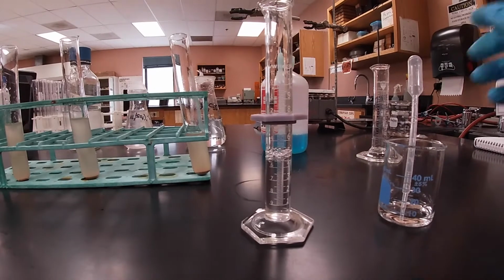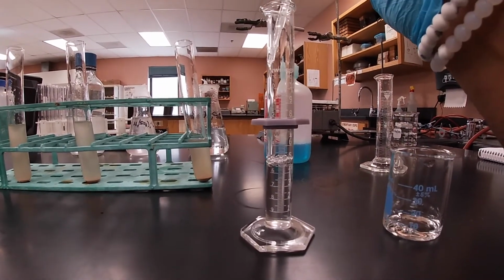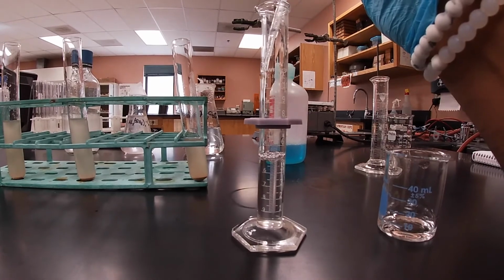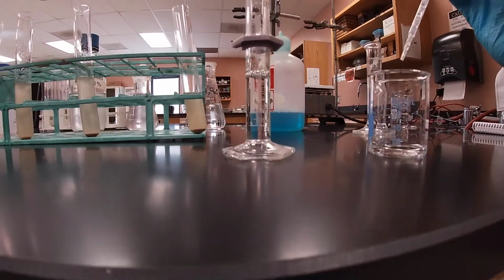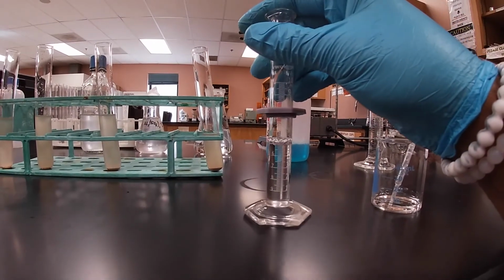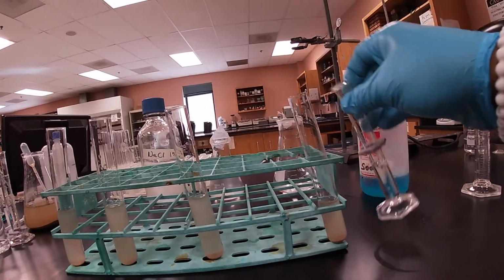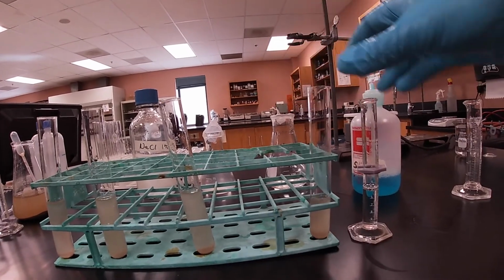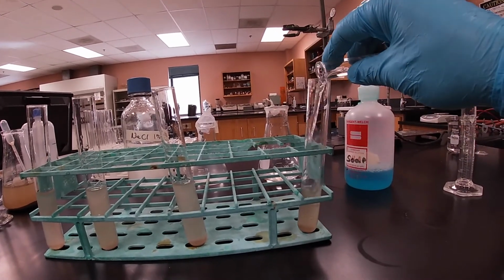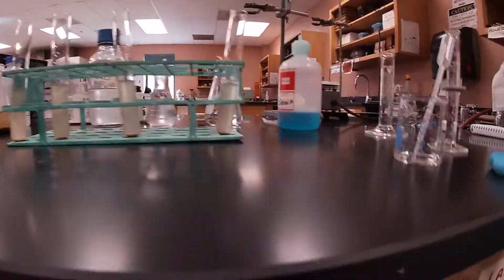And then just make sure that I am recording. Should get a little bunch of bubbles there. Should be good about there. Go ahead and enter our sodium sulfate sample.